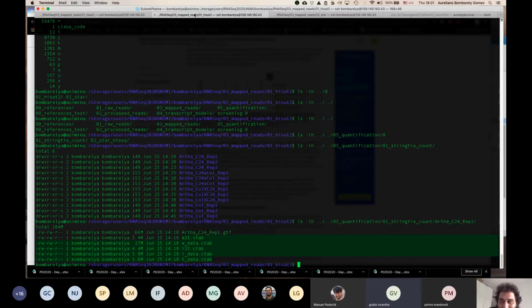Also, I read just today that using Trimmomatic, you have 4 output files for every sample in paired-end. And how can I deal with these 4 files? Can I throw 4 files to STAR or HISAT?